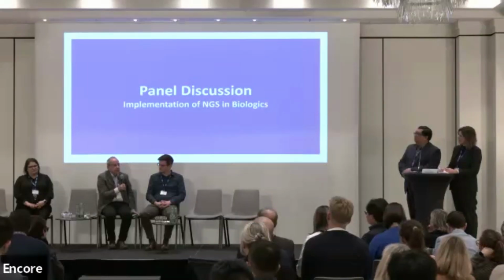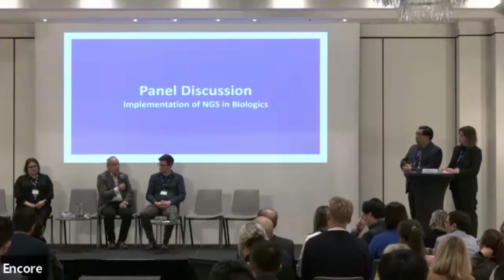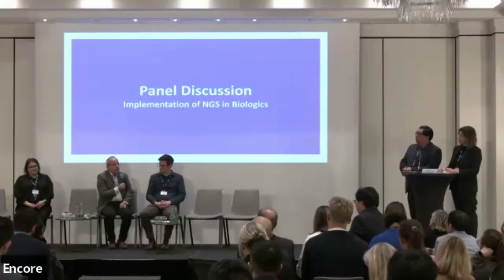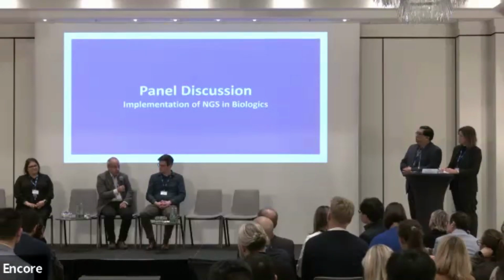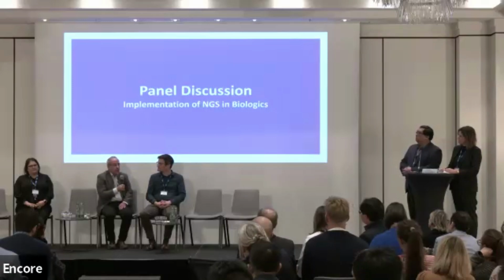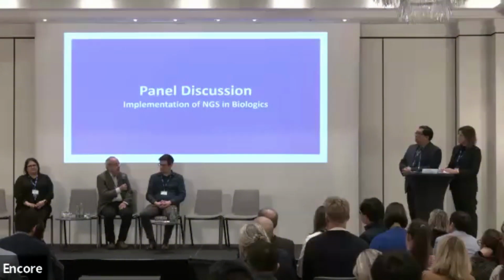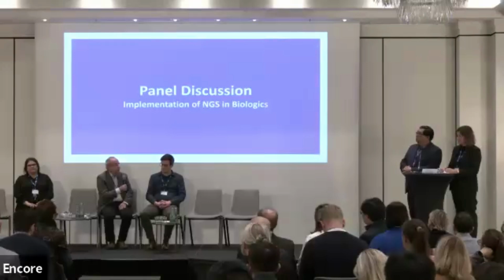Sterility testing, I can't really see it replacing that because it's too straightforward. But mycobacteria, mycoplasma, maybe. And then it's sort of an opposite problem than viruses: they tend to be too conserved. So our experience has been we can really only identify confidently at the genus level. However, we can work on that. We're going to work on that to try to get it more specific, because at the protein level, they're quite conserved. But if we get a protein hit, we can always follow it up with nucleotide level matching.